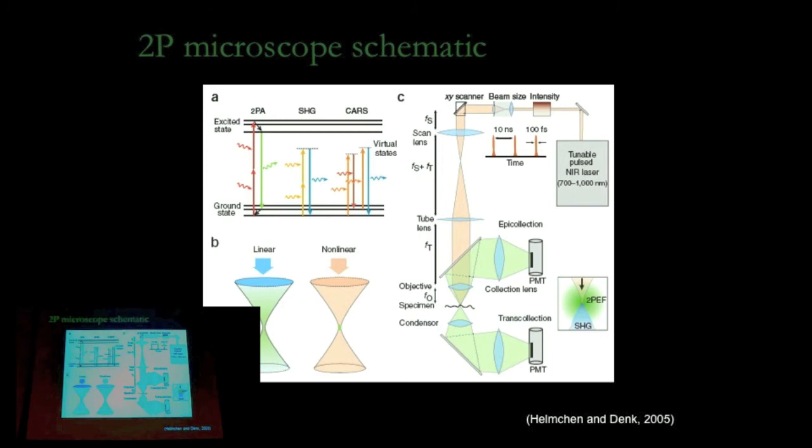Yeah, once it enters the objective, before it reaches the PMT, is there any change in the photon numbers? Yeah, they can get absorbed. Objectives vary, but there's typically like 70 to 90% transmission in the visible. Depending on the wavelength, right? Yes.